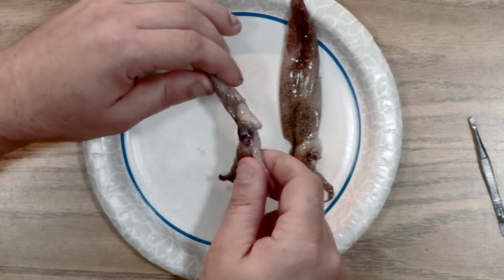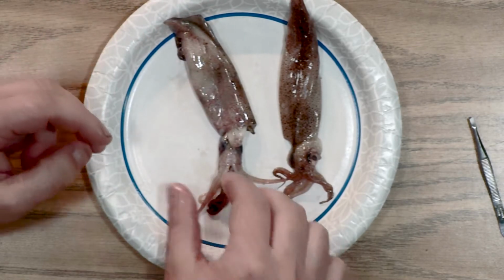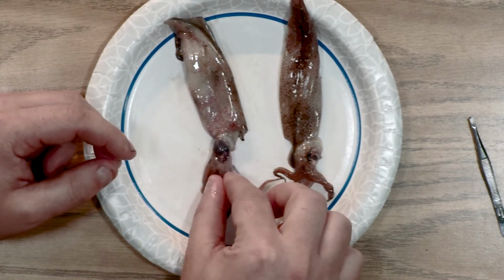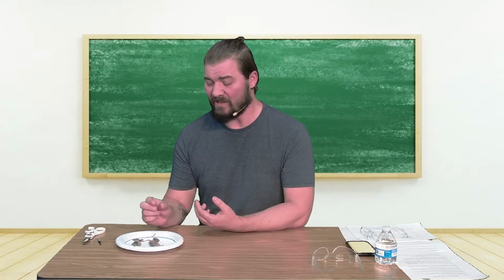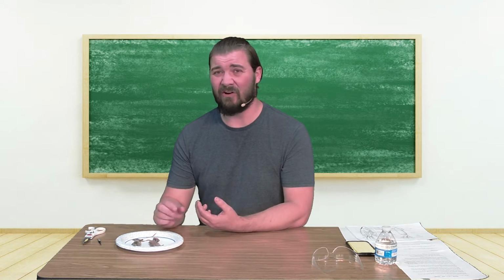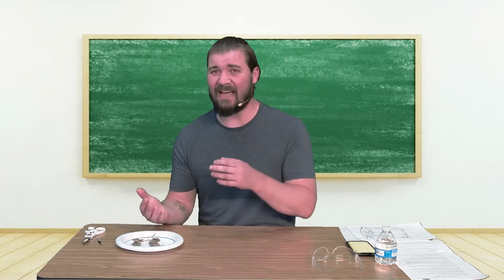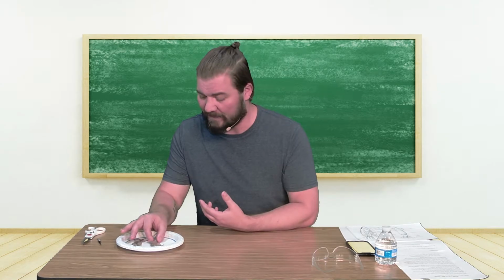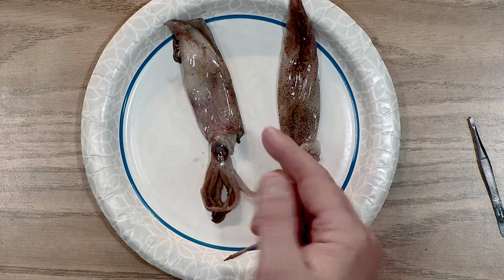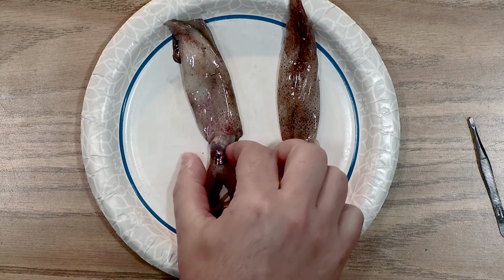It's got eyes on both sides of the head. Now the eyes of the squid are really similar to the human eye in the sense that inside it's got this lens that helps it focus and see underwater. It's got one of the most advanced eyes of all creatures underwater. And unlike our eye, though, it doesn't have an eyelid that's blinking shut all the time. It's always open like this, but it is protected by a layer of mucus instead, or this thin skin.